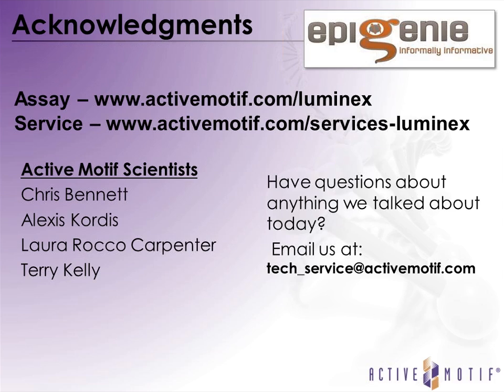First of all, you mentioned that there's a kit that's been available for some time now in the service. Are there any differences between what a researcher would expect from the kit, other than the fact that they're doing it instead of you, between the assay kit and the service itself? Yes. One of the biggest differences is that for the service, you would need to send us 200,000 cells as a frozen cell pellet.